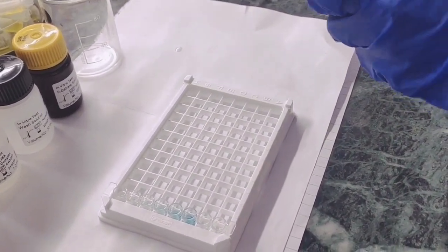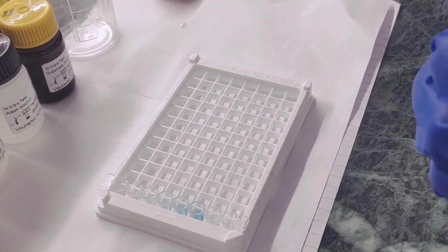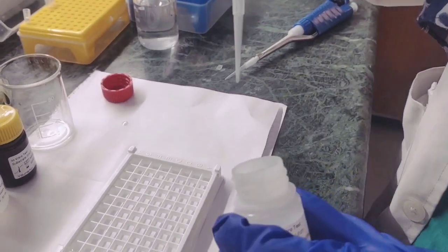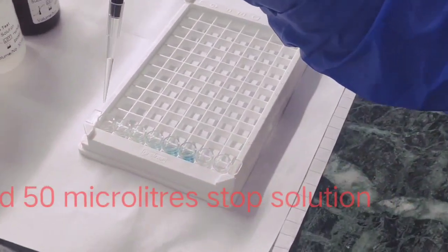Now we'll add the stop solution to stop the reaction and then we'll take the reading. We'll take 50 microliters of the stop solution in each well.